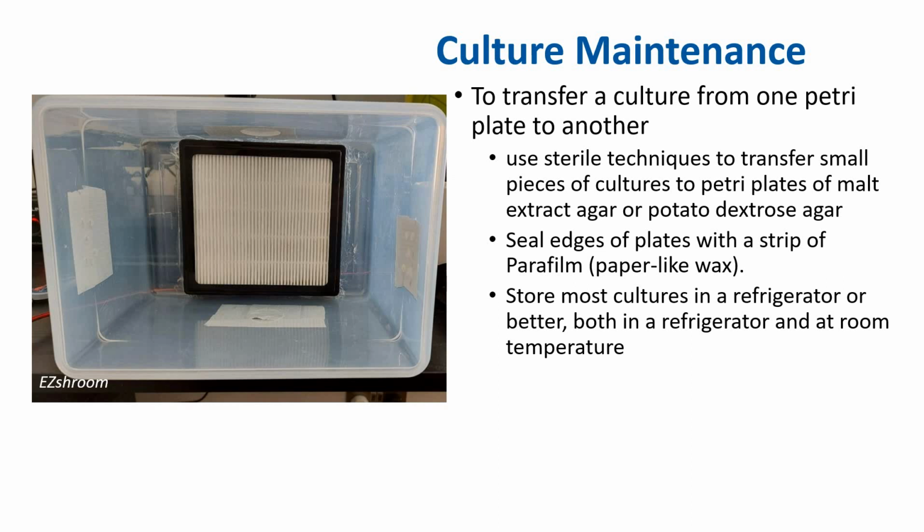basically to retain moisture. Store most of the cultures in the refrigerator, or better, store one in the refrigerator and one at room temperature, because some mushroom producing fungi are sensitive to the cold. For example, the straw mushroom cannot be stored in the refrigerator.